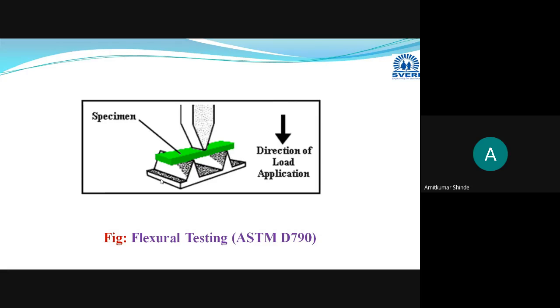Okay, I have written the name in the bracket, and remember that this particular ASTM standard D790 will be used for plastic materials. ASTM D790. Can you put the long form for that ASTM? I think already we have discussed this, or you are already aware about these things. I think you may have studied this in strength of materials or in metallurgy.